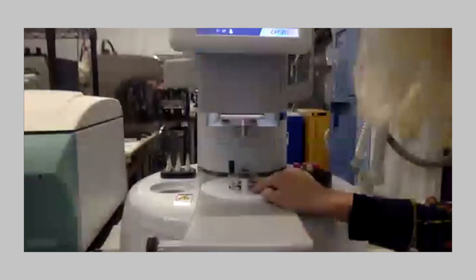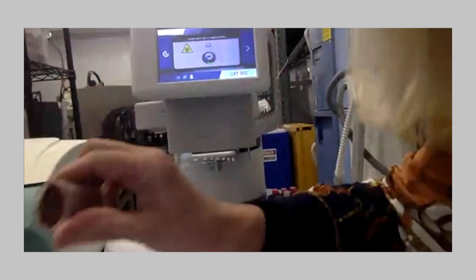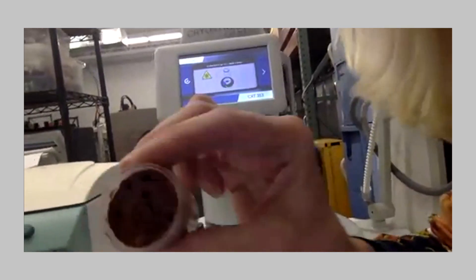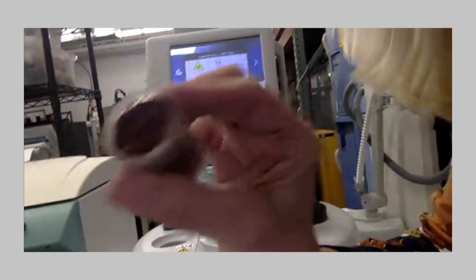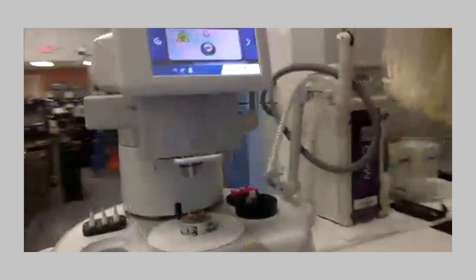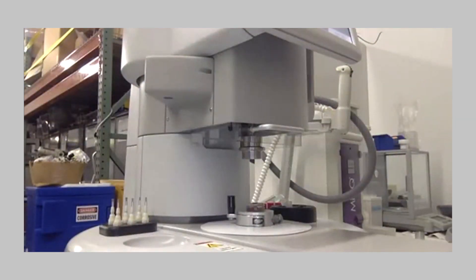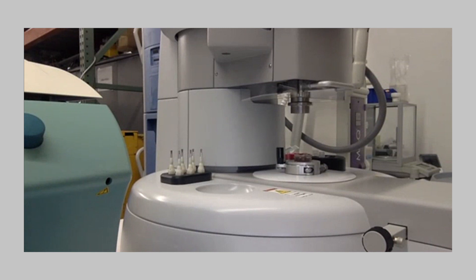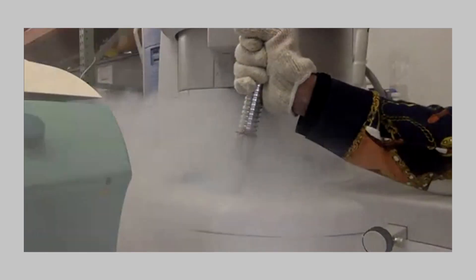Here's our sample stage. I am going to put my sample into the sample fixture. We use Sculpey clay, so this is our pretend feces tube. I put it into my sample fixture and tighten it up so that it's very tight. And now what I'm going to do during the demo is fill it with liquid nitrogen. I'm going to put on my gloves and pour slowly.